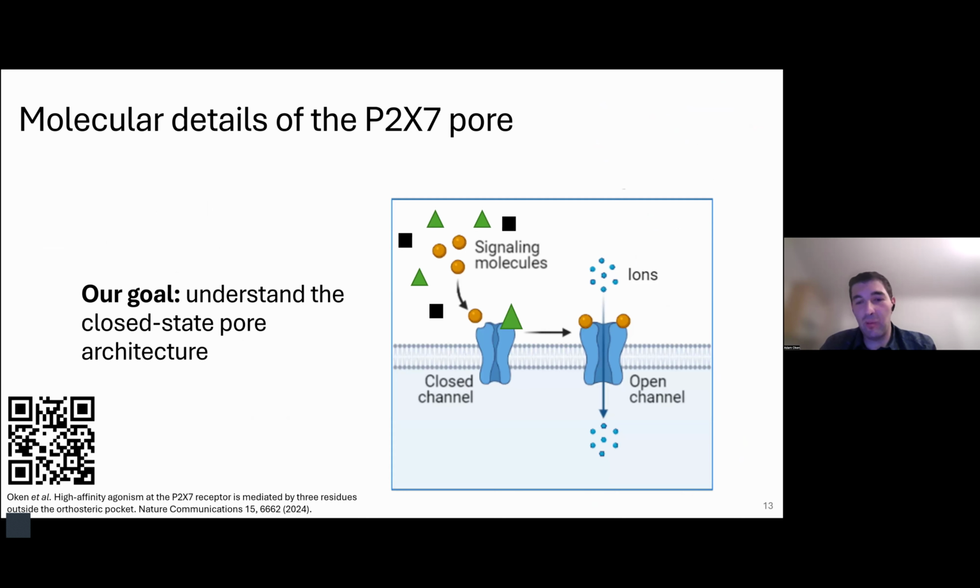So the first story I want to tell you today is about the P2X7 pore. And the story was recently published, so if you want to know more, please go ahead and read the article. But here, our goal was to use structural approaches to understand the molecular architecture of the P2X7 pore in the apo closed state conformation.